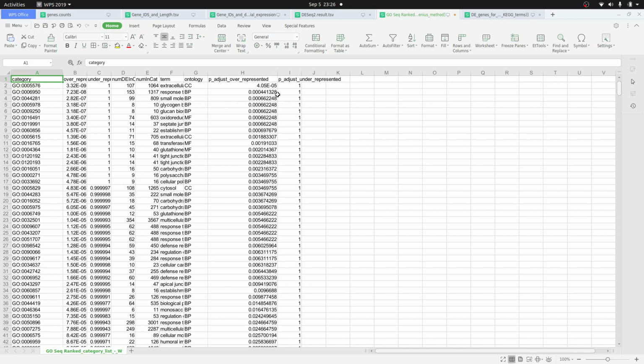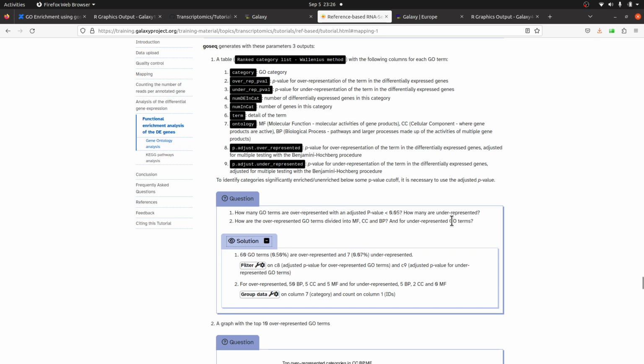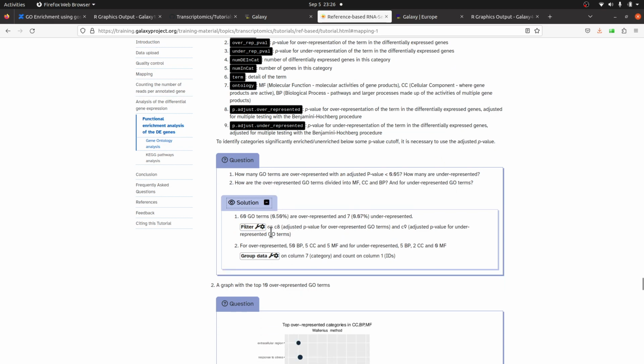For that one, I will leave it for you. But when I'm doing the R version of the tutorial, we are going to look at how to use the R code to explore this and then get some more information. All right, so that's something we are going to do with R. And please take note that you may not get the exact same number or the exact same values as we see in the answers, but you'll get something closer. All right, so just take note of that.